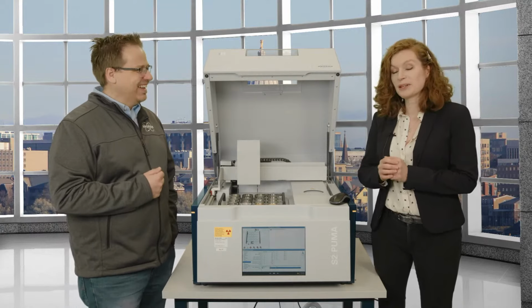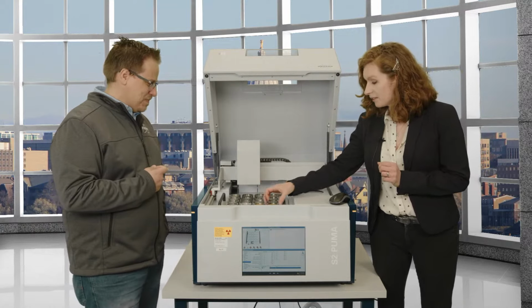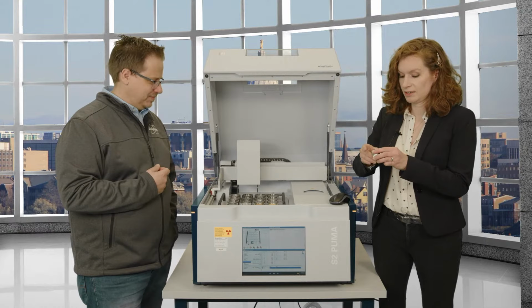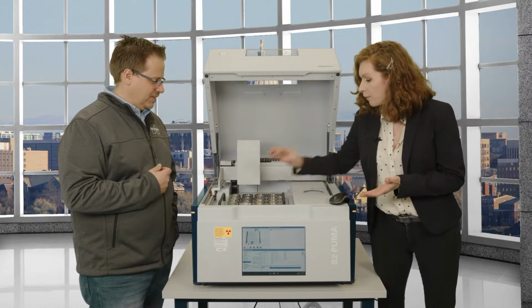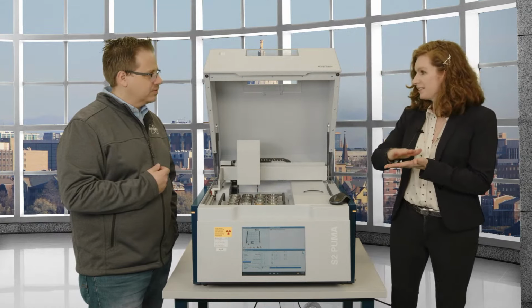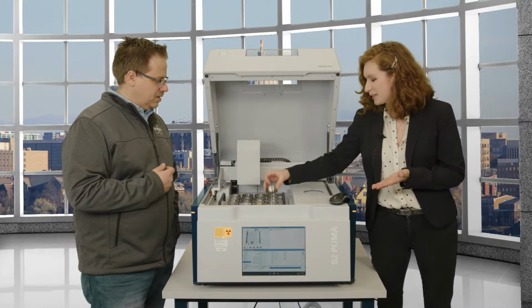What I want to show you is, first of all, the easy sample prep. All we had to do was cut them into the right shape. There's nothing else. They're flat on the bottom because they were on the baking sheet. We can also see that the store-bought ones are the ones that have the same height. I made one that's a little darker than the other ones because I guess it's burnt.